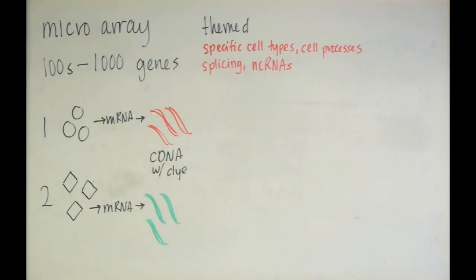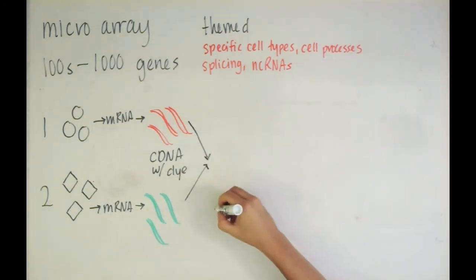Then you run your samples on a microarray chip, which has a bunch of different single-stranded DNA sequences printed in discrete locations on the chip. Then you analyze where and to what extent your samples bind on the chip to determine gene expression. A microarray chip is then essentially an array of tiny dots, which is where it gets its name. What does the procedure look like?